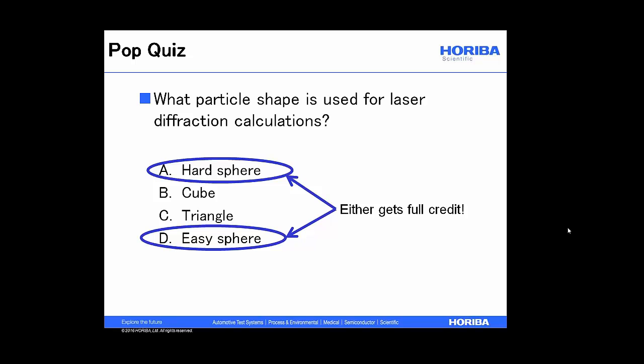Right. Okay, I did get a question in, which is how often should these machines be calibrated? I'm going to go into a bit about instrument-to-instrument measurements in the next section. By calibration, we're really going to be confirming instrument operation with standards. So you're going to go find yourself some particle size standards, preferably polydisperse, and make some measurements and see if the results match what you expect from the bottle.